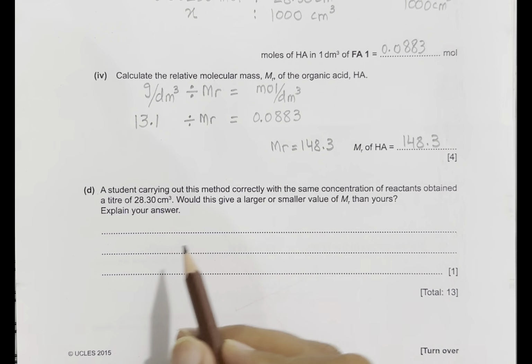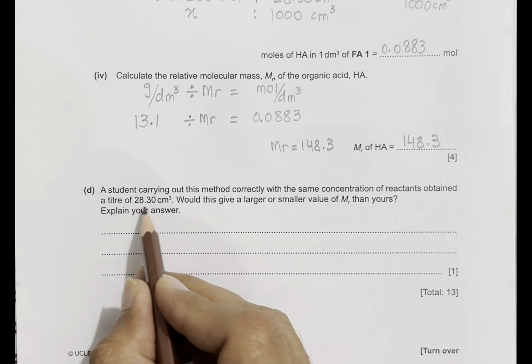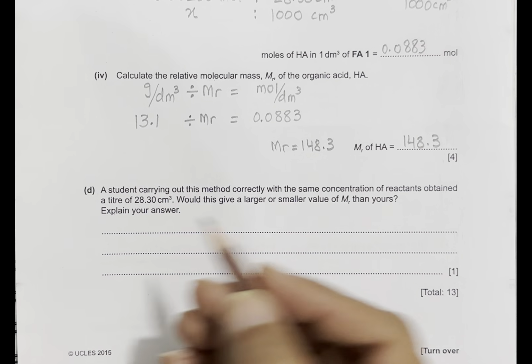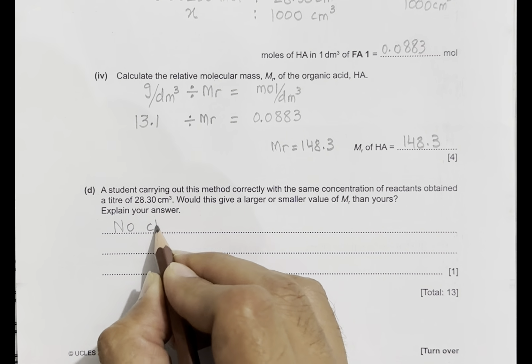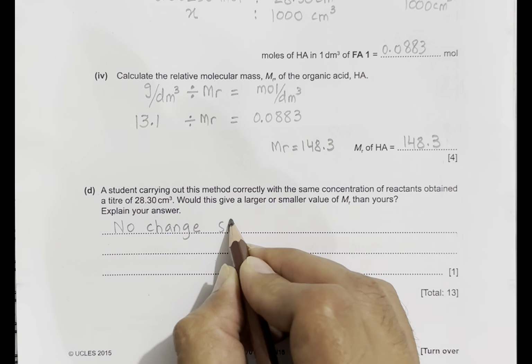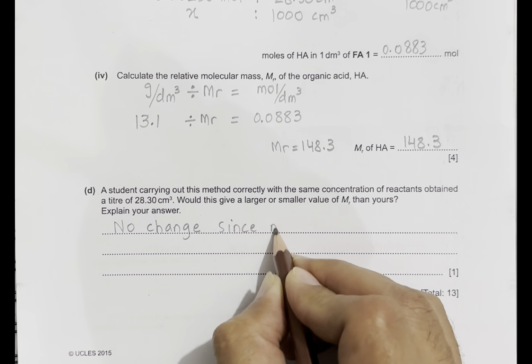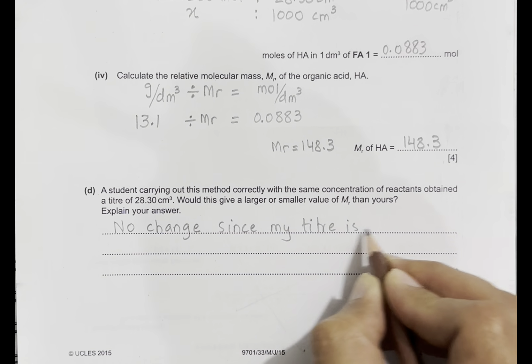Explanations which you can say: number one, in our case, we got the same titer value. So we will just say no change, since my titer is the same.